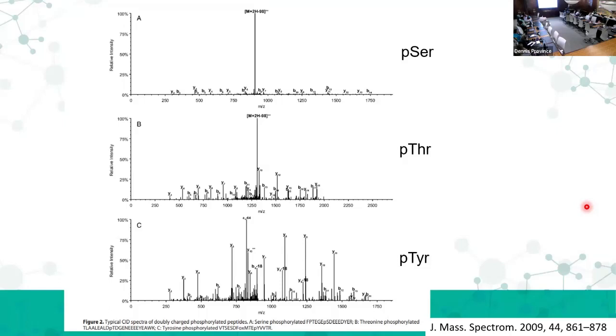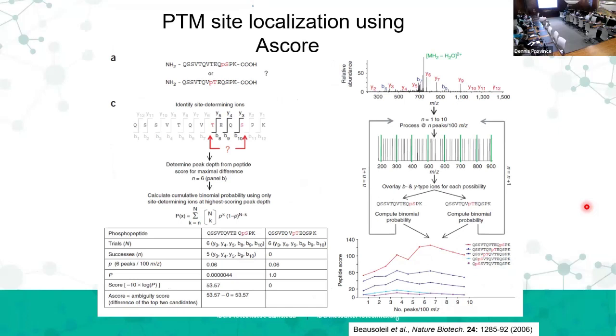So we got lots of sequence information. The serine and threonine, we're kind of having to look down here at the low level for sequence specific information, the information we're using to identify the peptide. And so now if we're counting strikes, we've got low stoichiometry. Some of it's going to fall off before it gets in the mass spectrometer. And now the third strike is, even if we do see the phosphopeptide, it's not going to fragment as well as a normal peptide. And so it's difficult. All of these things combined make it really difficult to identify phosphopeptides.